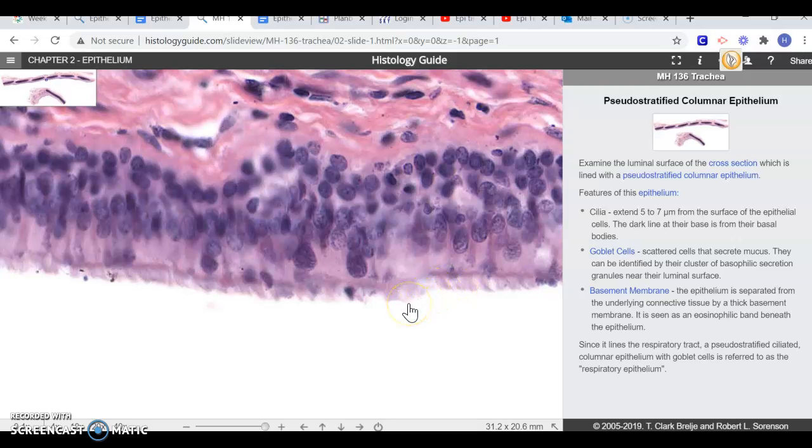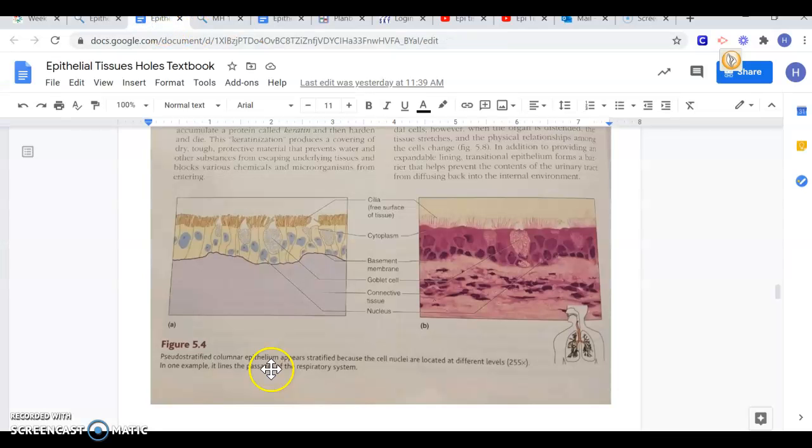And so when we go to look at those goblet cells, I would say here's a good example. You can basically see how it's releasing that mucus. That's what we're looking for, and so that's what you want to do your best to draw. And like I said, sometimes it's very unclear. You can't clearly see those cell membranes, so you want to refer to the pictures from the book. Use that to help guide you.